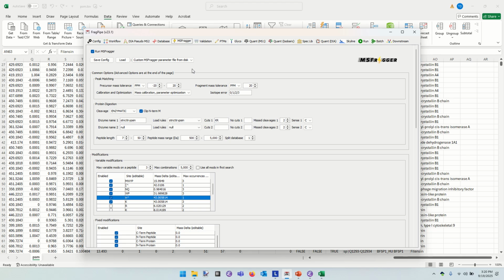And then up to 20 times that. The worst possible search space for open search is that every peptide gets compared to every MSMS. But you're already reasonably close to that using a search space of -150 to 500. It's not going to change tremendously by upping the ceiling to 2000.